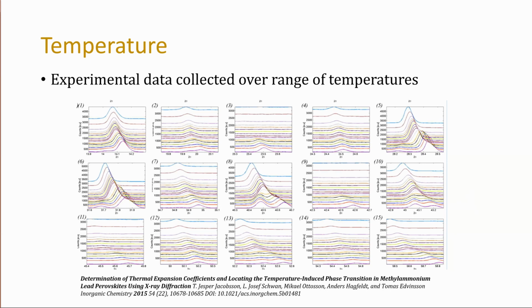You can see in many of the graphs the leftward shift that you would expect from the theoretical X-ray diffraction patterns shown before. And the greater shifts are obvious, as well as the merging of the two smaller peaks in graphs 8 and 10 that show the transition from tetragonal to cubic structure of the methylammonium lead iodide crystals occurred about midway through the temperature-dependent measurements.